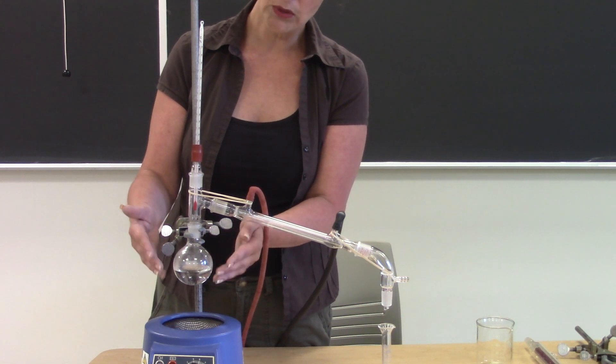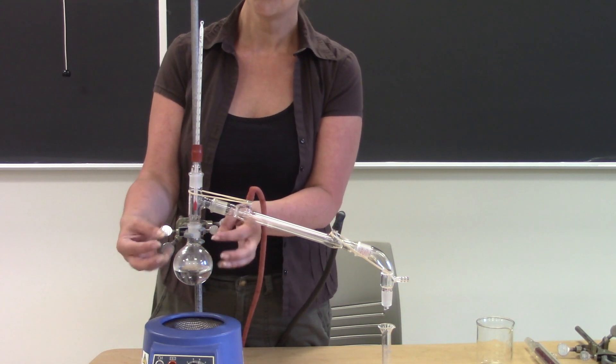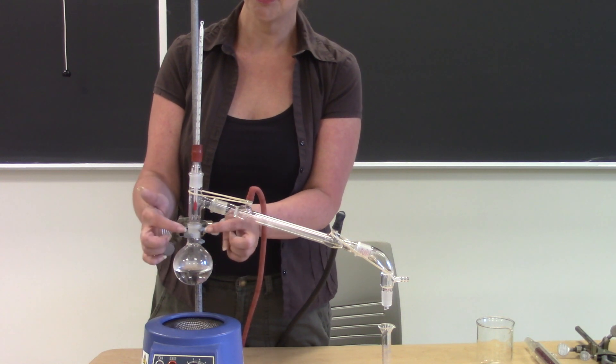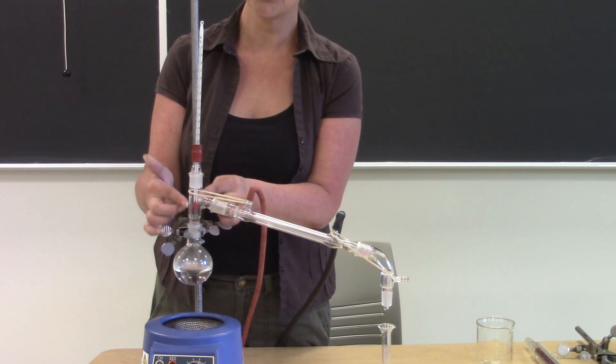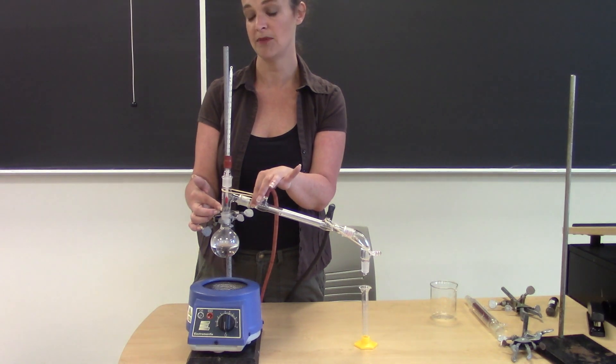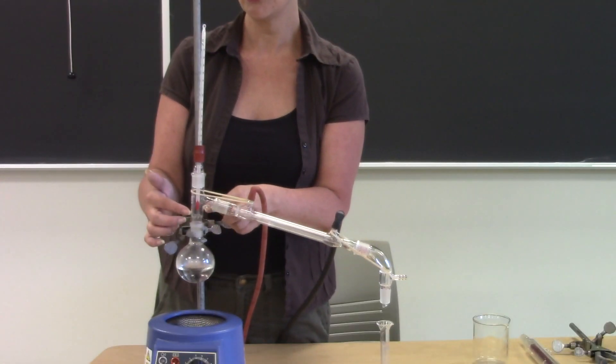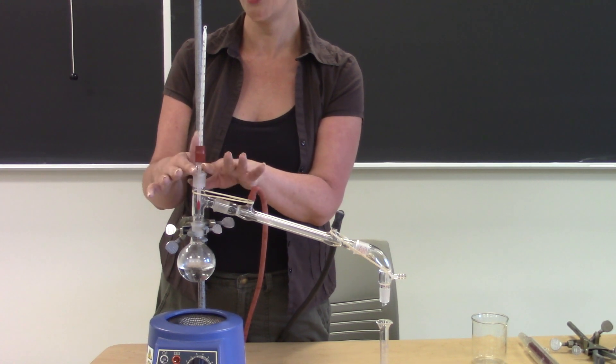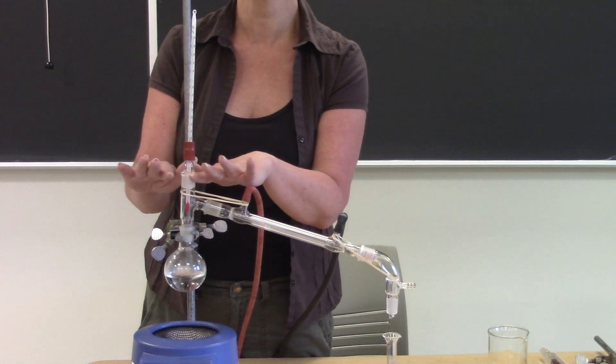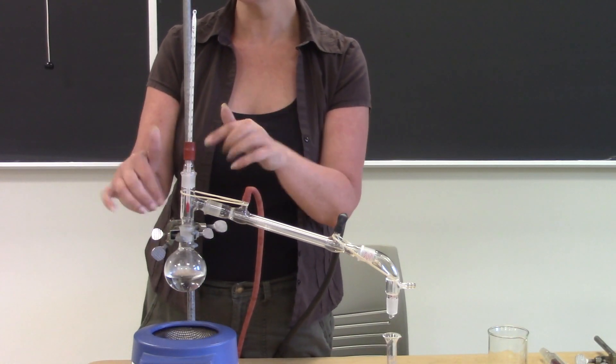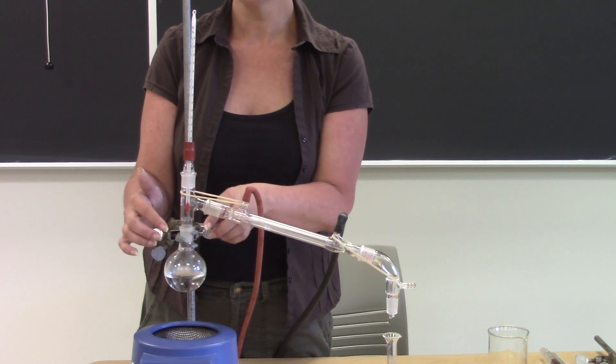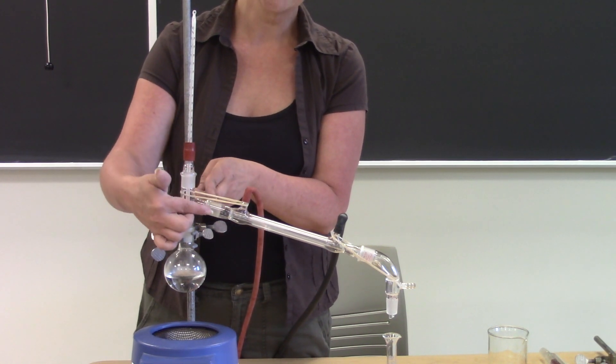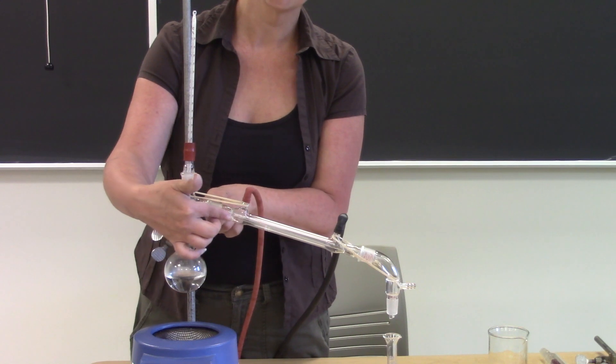And when we heat this to boiling, it's going to boil up. The vapors are going to come up through the neck of the flask and they're going to go into what's called a distillation adapter. So the vapors can go up and they can hit the thermometer adapter on the top here, but this is sealed so they can't go anywhere else. So they're just going to bounce around and maybe come back down, and they're going to go down into this part that's coming off to the side.